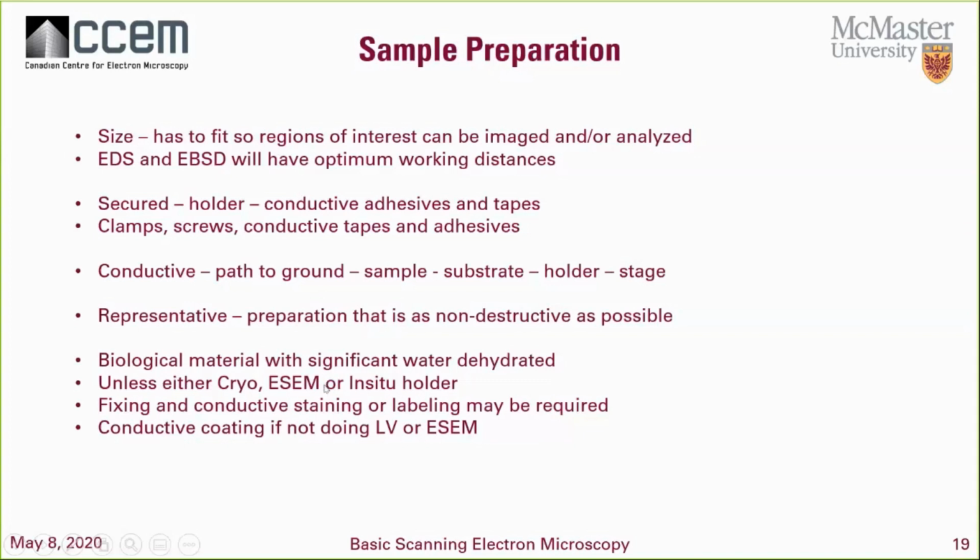The other thing you have to consider is that whatever preparation you do, you're going to have a nice representative sample. So it's not going to obscure what you want to look at, and it's not going to add any elements that are going to be bad for doing analysis.